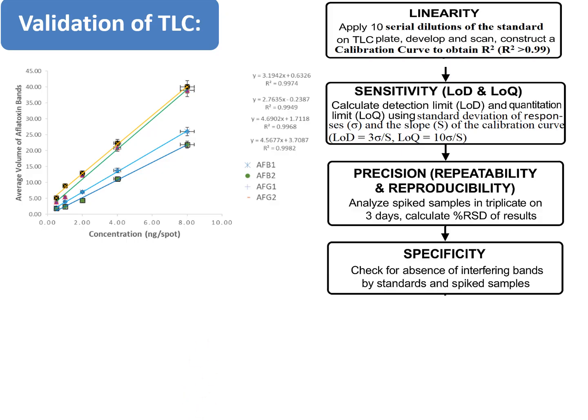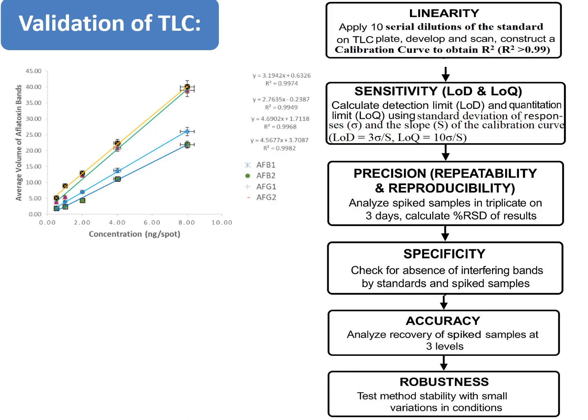Now, the other parameters that are also measured during method validation include accuracy and robustness.